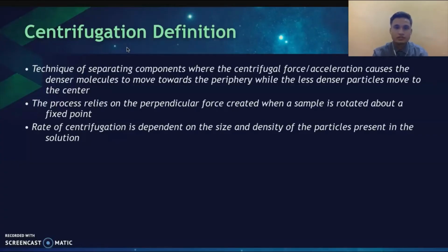Centrifugation definition. It is a technique of separating components where the centrifugal force or acceleration causes the denser particles to move towards the periphery, while the less dense particles move towards the center.